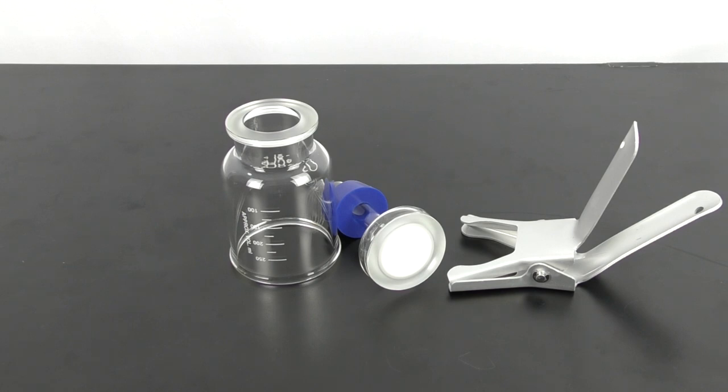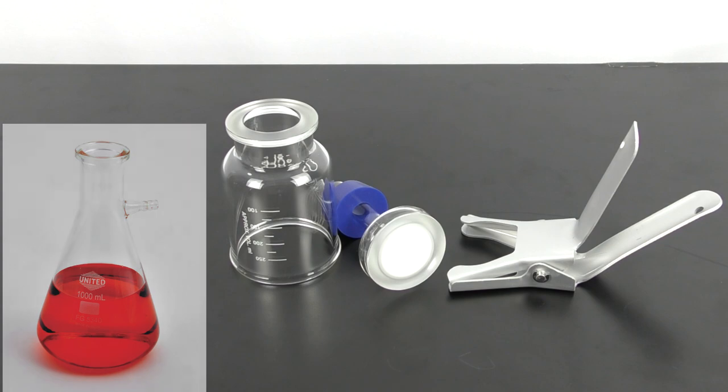Additional items that you will need are a vacuum filter flask and a vacuum pump.